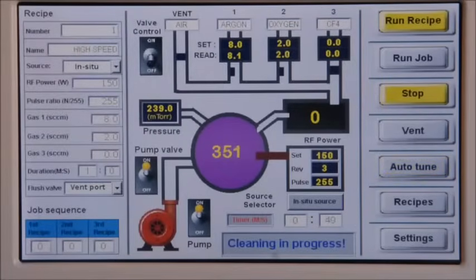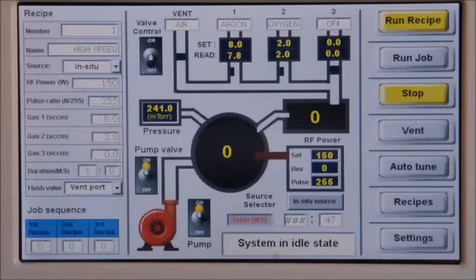Impedance matching will automatically kick in if necessary. The system timer automatically starts to count down after plasma ignites. Once the timer counts to zero, the cleaning process will stop.